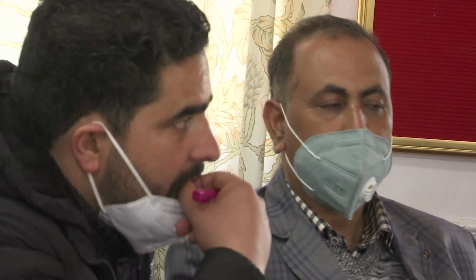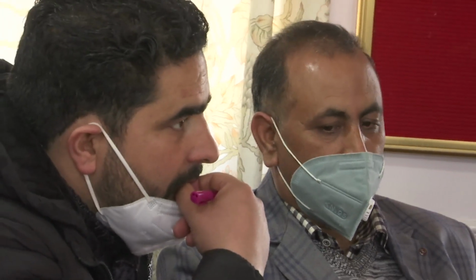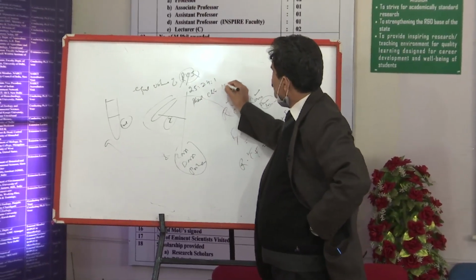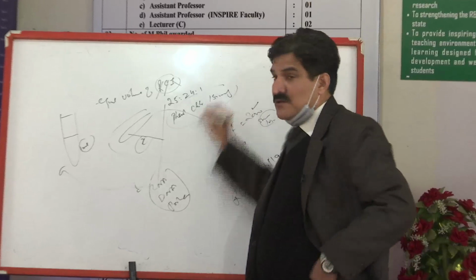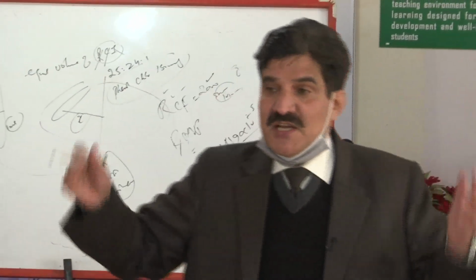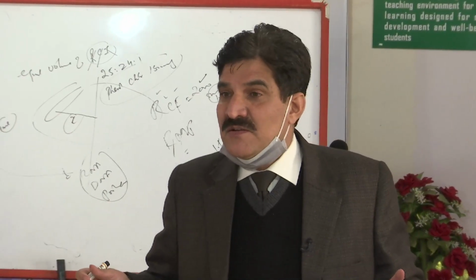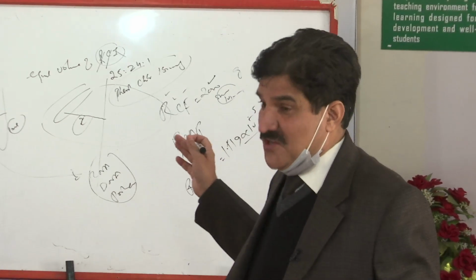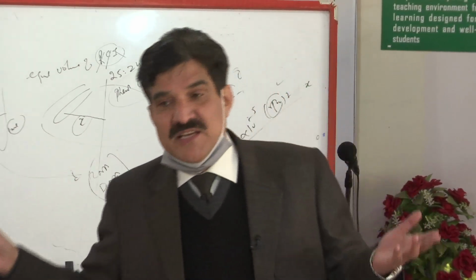Sometimes you can take a little, but in order to have a good quantity of purified DNA, you can utilize an equal volume of PCI. Now the question is what PCI is. I will represent it here: it is phenol, chloroform, isoamyl alcohol. Do you know their role? What is their function? You should have this point in mind. It is very crucial in isolation of DNA, RNA, anything.